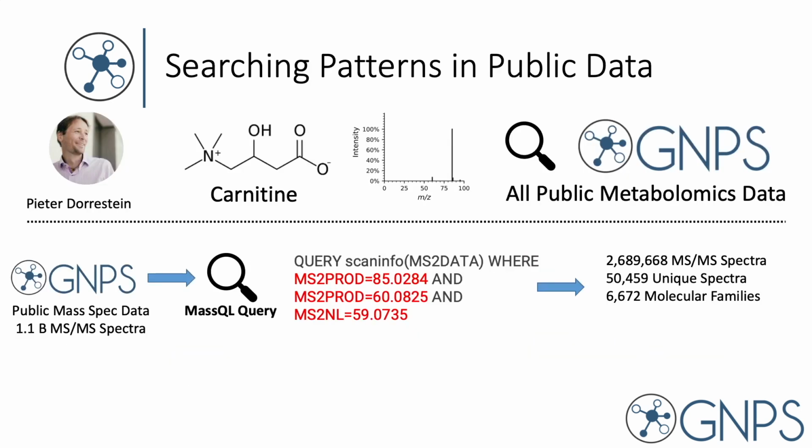And so circling back upon what we talked about at the beginning of this presentation, one particular compound class that Peter and the whole lab was interested in over the last couple of weeks on the Slack channel was carnitines. And whenever Peter asked me about carnitines, since we invented MassQL, you know what I could tell him? Do it yourself. And so he was able to write his own query for these particular distinctive fragments for carnitines and search public mass spectrometry data for them.